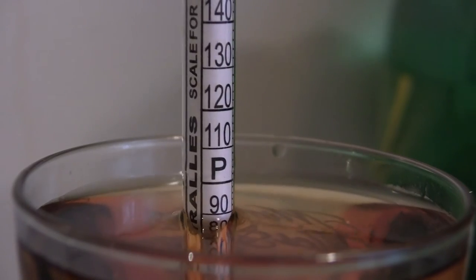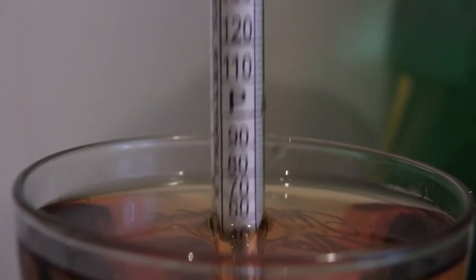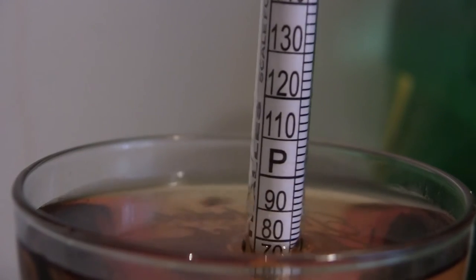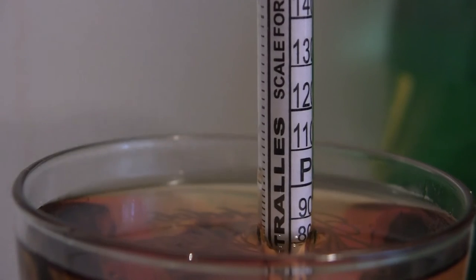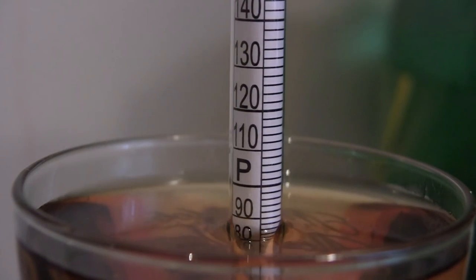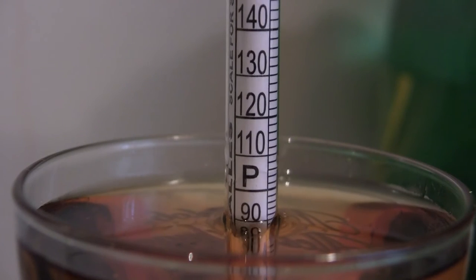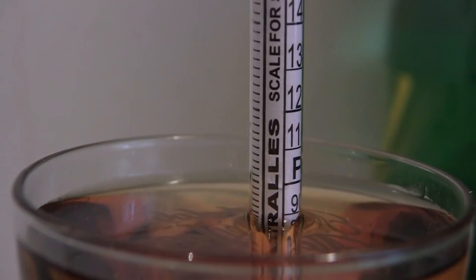Which — that's proof. This is supposed to be 80 proof. Canadian Mist, 40% alcohol by volume, which is 80 proof. And the hydrometer is reading that this alcohol that came out of this bottle is well over the 80 mark. There's the 80 mark — watch it sink. When I let go of it, it sinks.